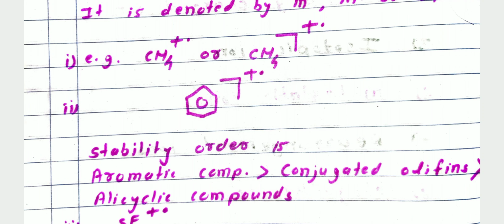The molecular ion has an odd number of electrons and also a positive charge, therefore I write plus and dot. The molecular ion is nothing but the original analyte molecule with one electron less, so its m/e ratio directly gives the molecular weight and is important for finding the molecular formula.